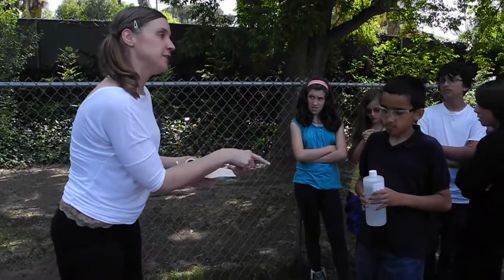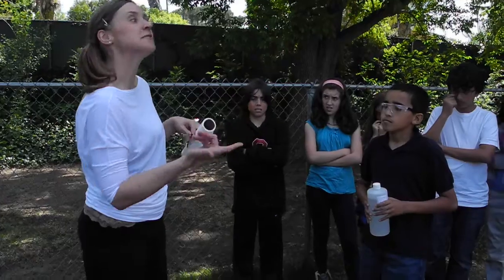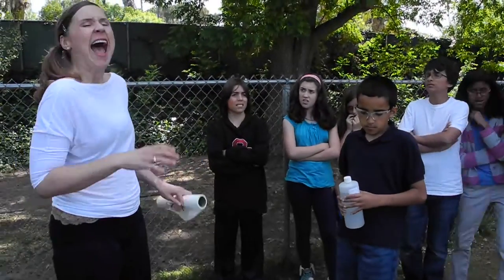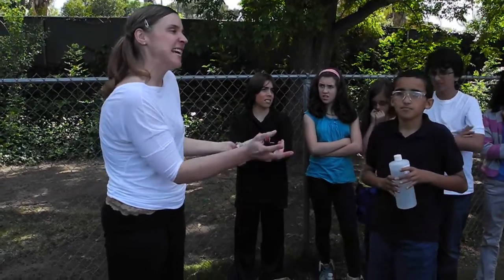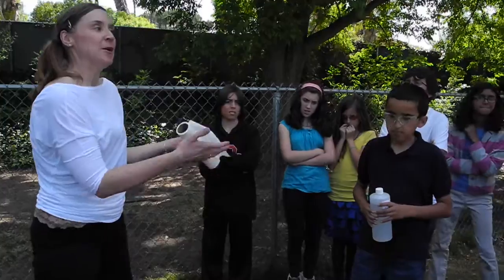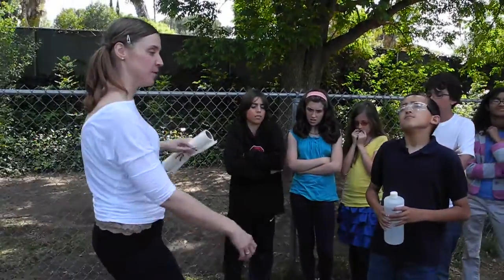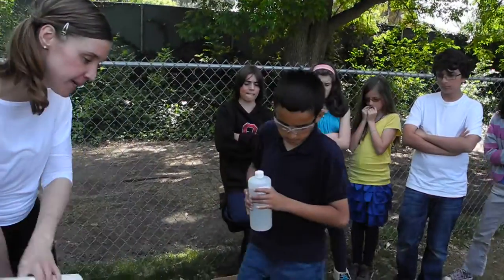Now, Eric's got the glycerin, and does anyone remember what we said this stuff is essentially? Glycerin is sugar water. Yeah, it's like sugar water. I've never potentially tried to make my own glycerin. They say it's like sugar water, but I always order it from a science company, so some people have said you can find it in pharmacies and whatnot. I have not. Beside the point, Eric, you're going to be my pour person.